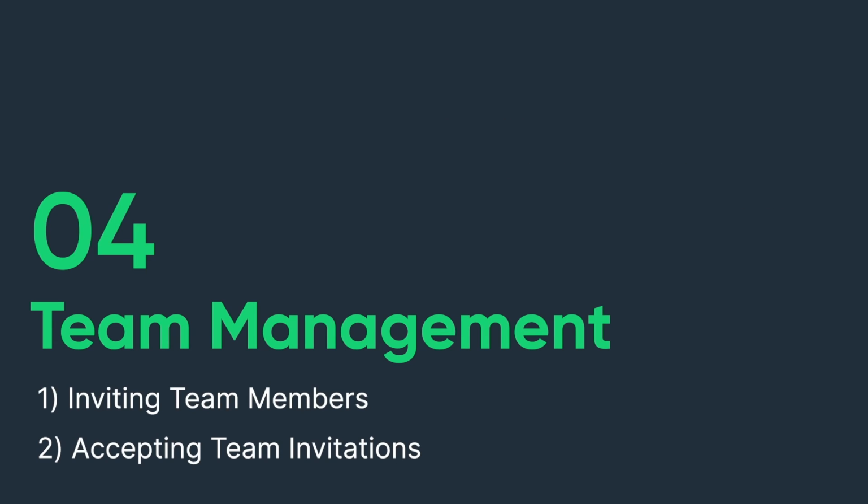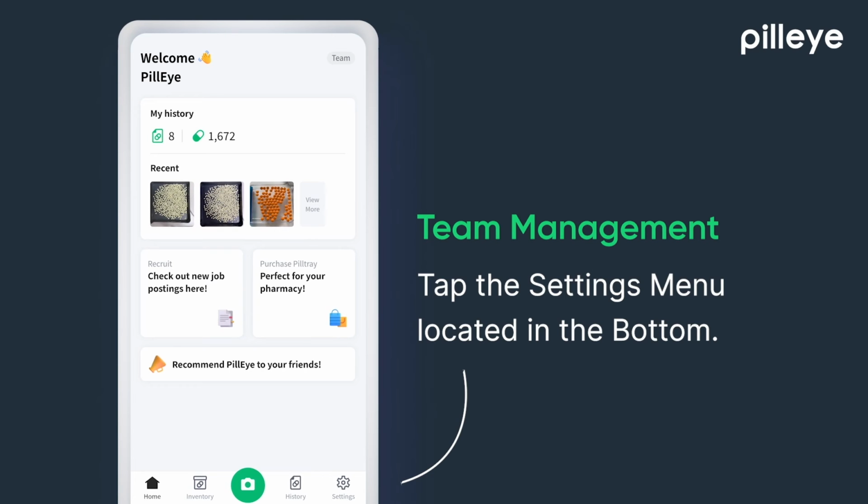Team management. PillEye offers a team management feature that lightens the load of pill inventory counting by distributing the workload among team members. To use this feature, tap the Settings button at the bottom of the home screen to access My Team menu.